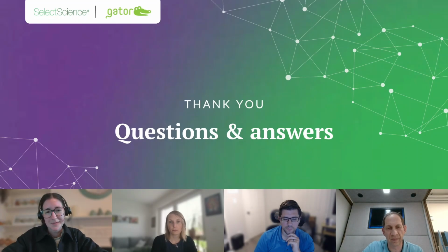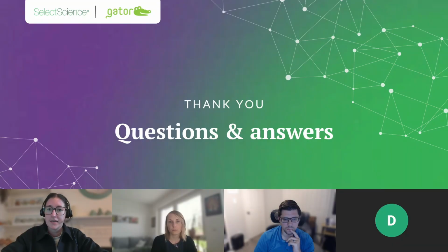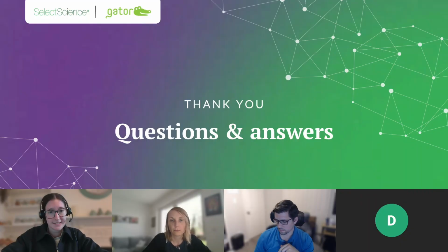That's great. Thank you both for those answers. I've got another question here for Alexandra. Alexandra, since Strep-Tactin XT has an affinity to biotin, can biotin or biotin-related proteins interfere with the BLI assay if I use a Strep-Tactin XT coated biosensor?